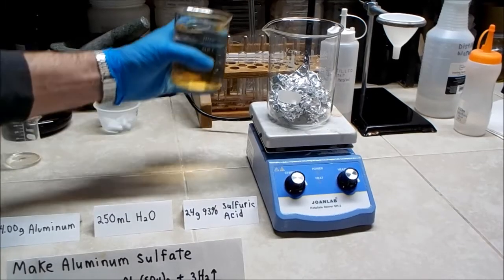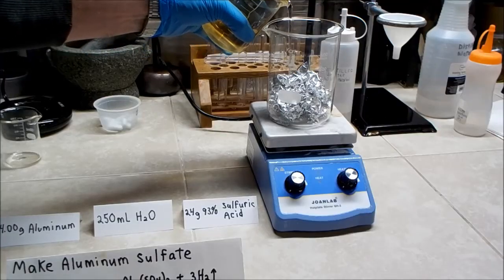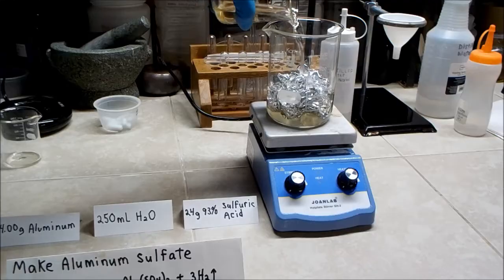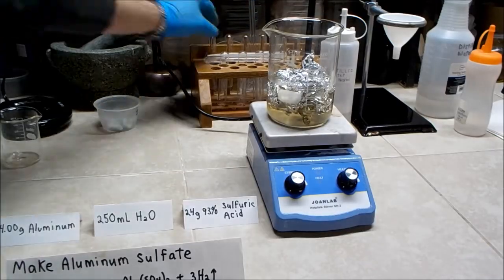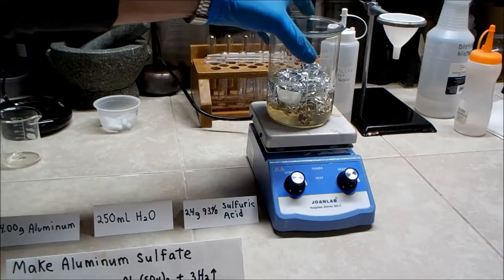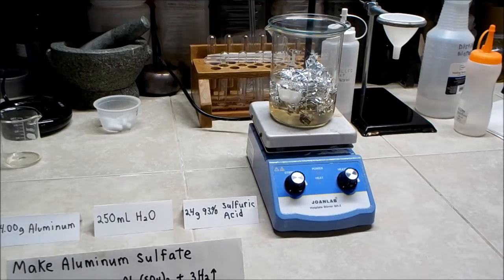I pour the dilute acid solution over the aluminum foil and cover the beaker with a watch glass. The watch glass will slow the evaporation of water as the solution will become heated during the process. This reaction is very slow to start and will require heating to get it moving along.